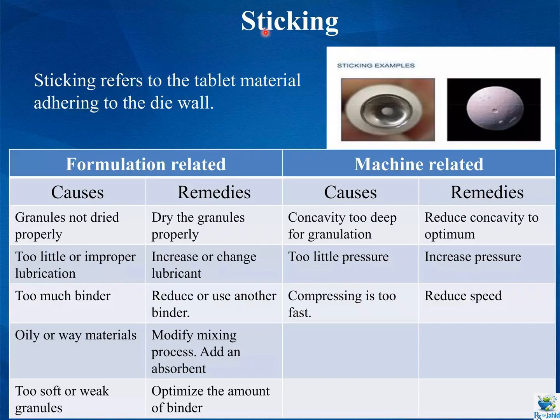Our next tableting problem is sticking. Sticking refers to the tablet material adhering to the die wall or punches. So formulation related causes include granules not dried properly, too little or improper lubrication, too much binder, oily or waxy materials, too soft or weak granules.